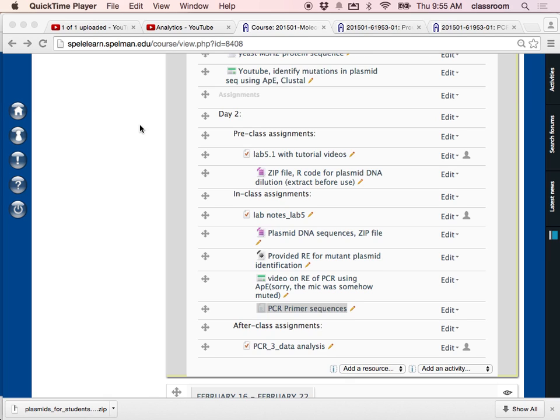How to use APE to analyze the PCR product and how to find out which restriction enzyme is going to cut the PCR fragment between the wild type and mutant.